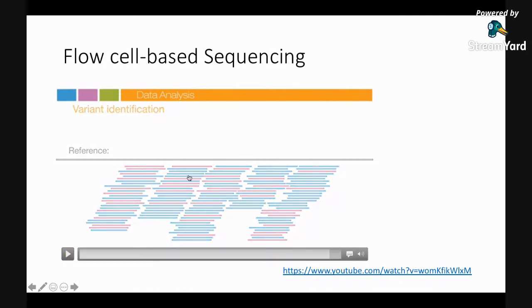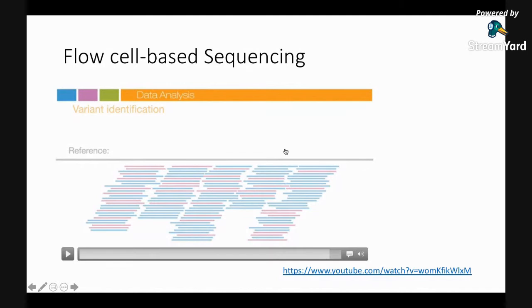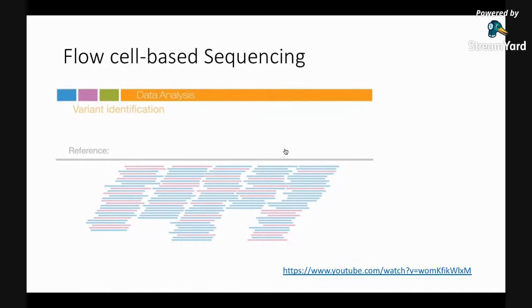So in the last part, he said that the paired-end sequences are used to resolve ambiguous alignments. We'll go into that. The last two sentences that he said, we'll look into later.